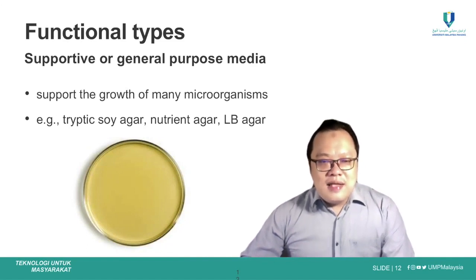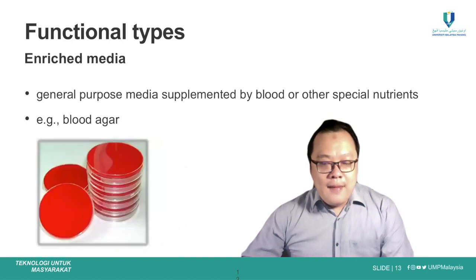This type of media is able to support all these bacteria, fungi, algae on the agar. In comparison, the enriched media are commonly used to enhance the growth of those fastidious types of microorganism that are not able to grow on the general purpose agar.